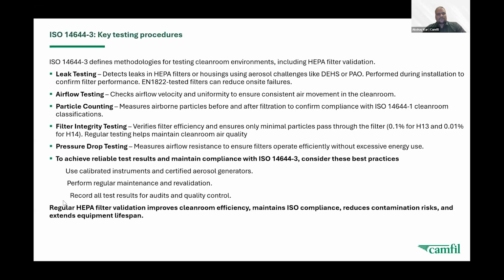We are actually taking out a few of the tests. One is the leak test, which is done at site during installation of filters to understand exactly how many particles there are, and it should follow the protocol given in the guideline. Then we have the airflow test, which is generally done to check the uniformity and to ensure there is consistent air movement in the clean room, which is required.